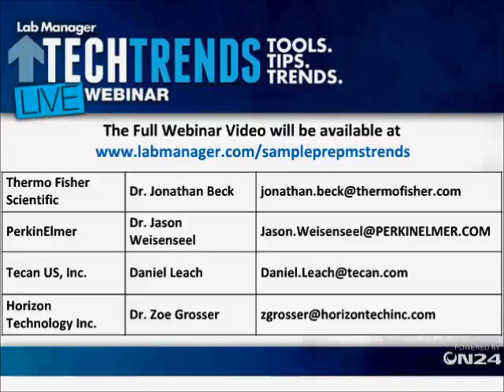Yeah, our TurboFlow, this is Jonathan again from Thermo. We have analyzed honey samples with our TurboFlow technology that I spoke of earlier. Typically that requires some sort of dilution, either with solvent or water, depending on what your sample is. But other than that, it can take some fairly viscous samples. Honey is probably a good example because it is pretty thick, but we can dilute that down before we inject it onto the automated system. So I'll see if anybody else has any more on that.